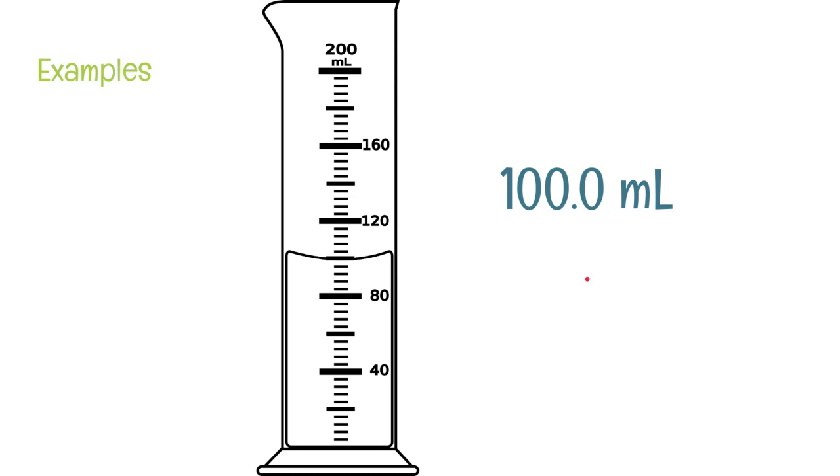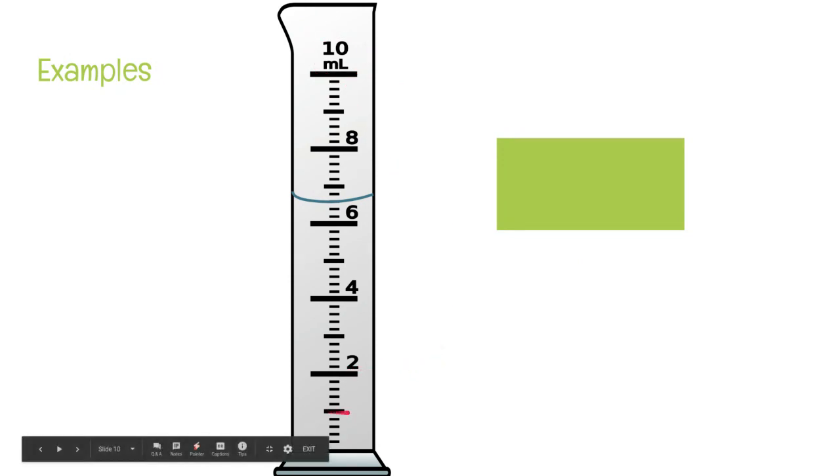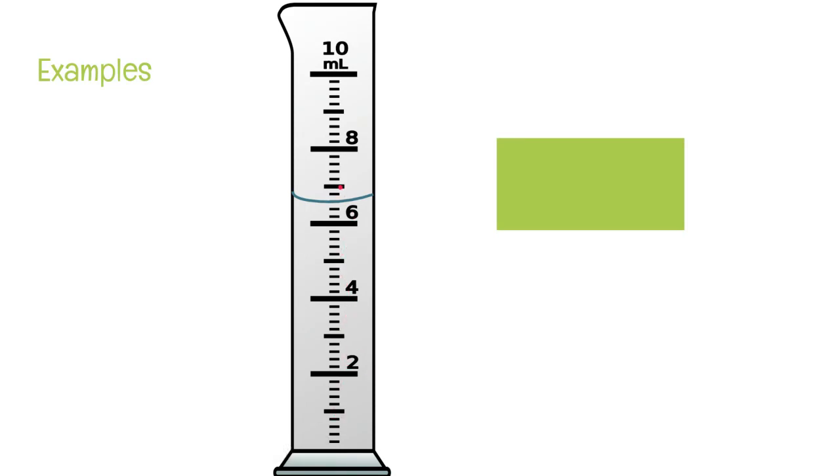Are you ready for level 2? I can't get a response from you because I'm doing this in the future. But here we go. Okay, this is a 10 milliliter graduated cylinder. It goes by ones, but it's written by twos. So this is really 1, 2, 3, 4, 5, 6, 7, 8, 9, 10. But only every second digit is written to keep it from looking cluttered. So if this is 6 and this is 8, that means that this bolded line in between them needs to be 7. For this to go from 6 to 7, this is going to be 6.0, 6.2, 6.4, 6.6, 6.8, 7.0.